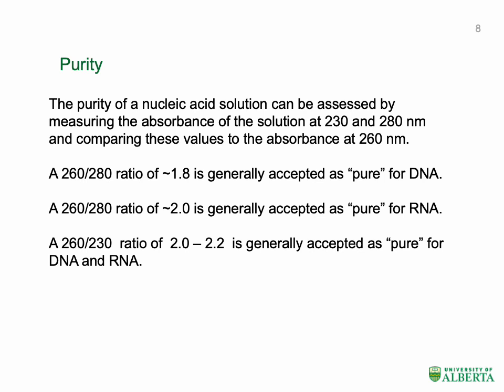In the lab, DNA and RNA can be isolated from a variety of different sources such as blood, urine, tissue, and bacteria. Most commercial kits yield pure DNA and RNA. However, it is still good practice to check that your nucleic acid preparations are free from contaminants. This is done by measuring the absorbance of the aqueous nucleic acid solutions at 3 wavelengths, 260, 230, and 280 nanometers. The ratio of the absorbance reading at different wavelengths is used to determine purity.